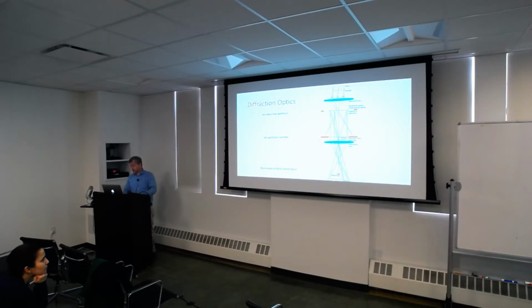The other thing is, because you're only collecting diffraction spots, you're no longer sensitive to sample drift, because you're not collecting phases, you're just getting amplitudes. So if the sample moves a little bit, those spots stay in the same spot. So you don't actually care if the sample is moving a little bit. Obviously, if it moved a lot and left the actual imaging area, that would be bad, but you're much less sensitive to drift. This is one of the reasons why it was easier to get higher resolution structures earlier from, say, 2D crystallography than from single particle.